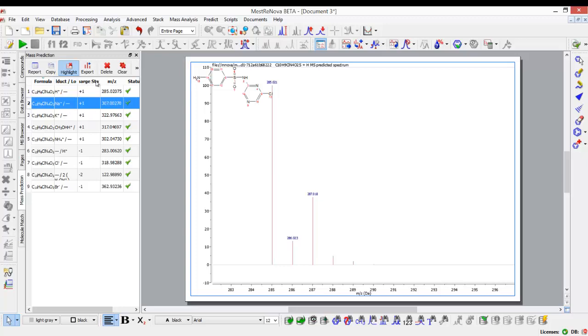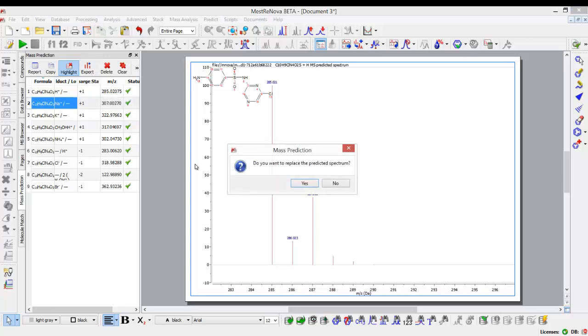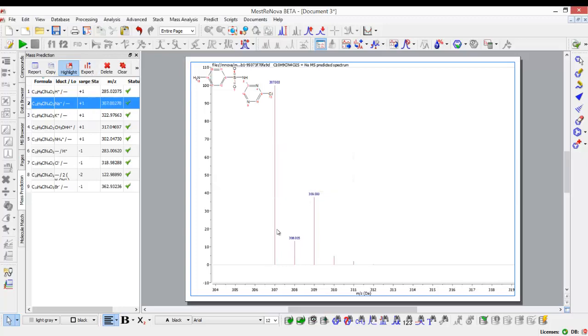And again, the same would happen if, for example, I want to look at the sodium instead of the protonated compound. Here, as you can see, I get an isotope cluster which has a mass 22 units higher than the previous one.